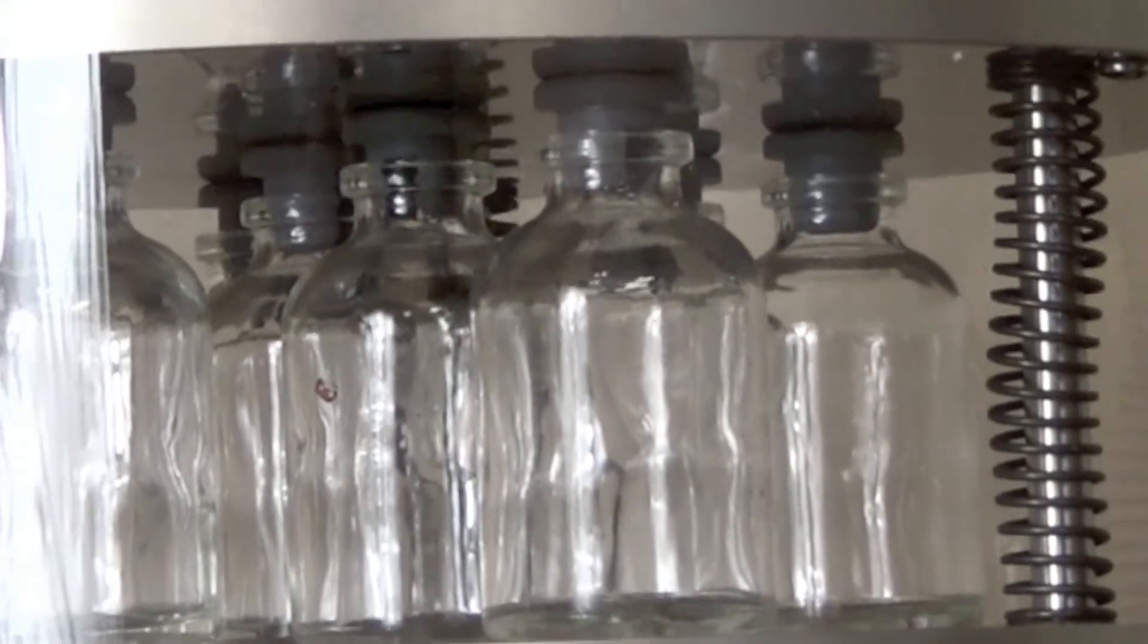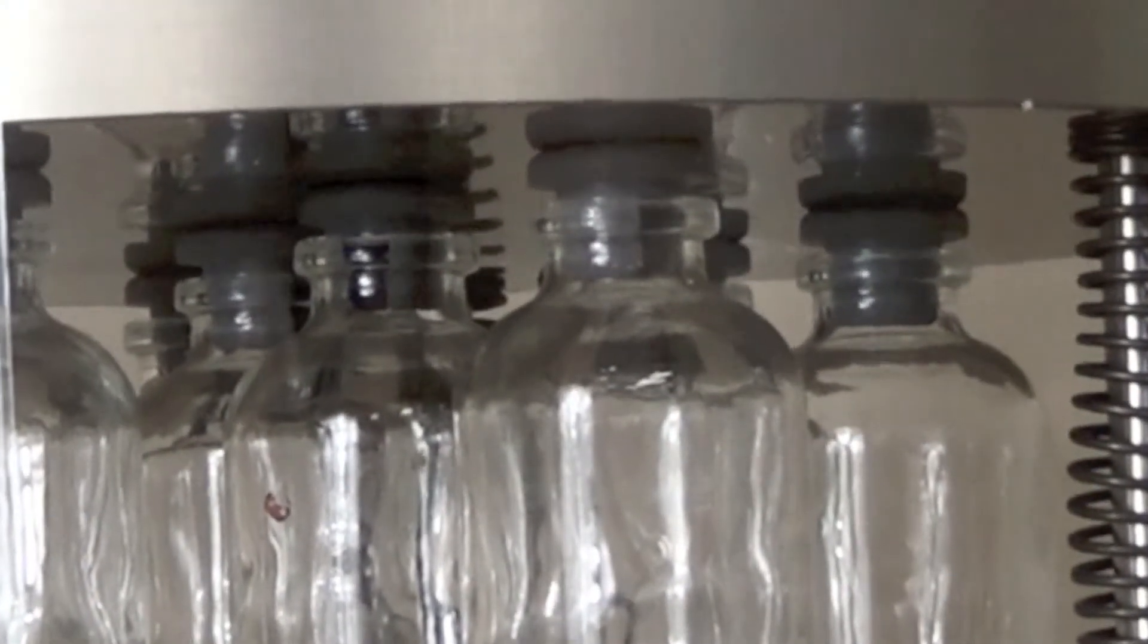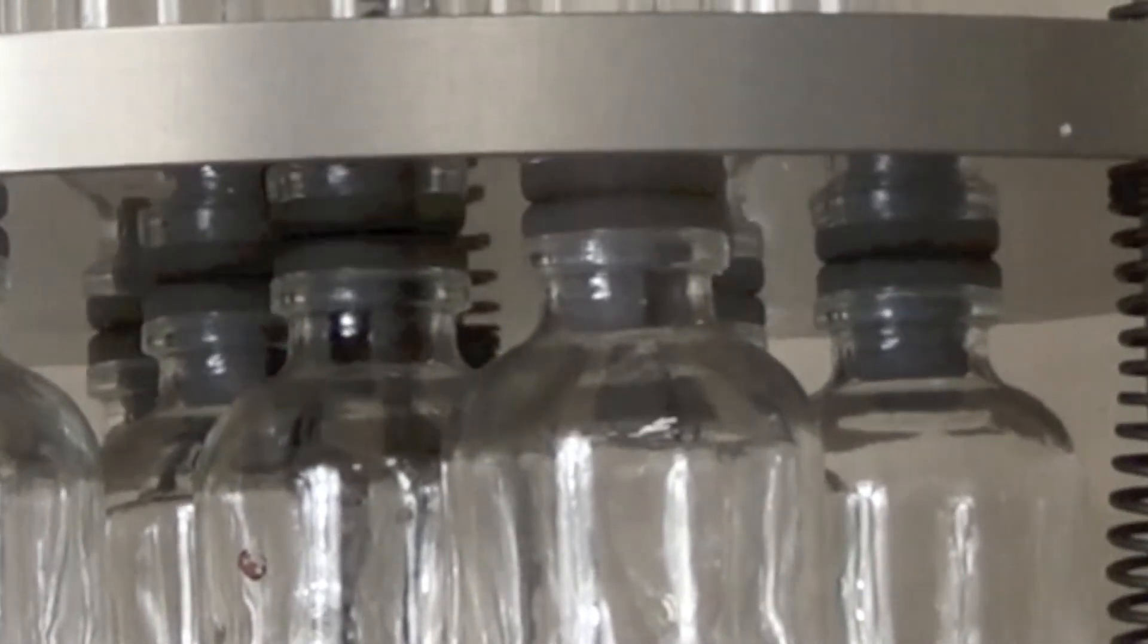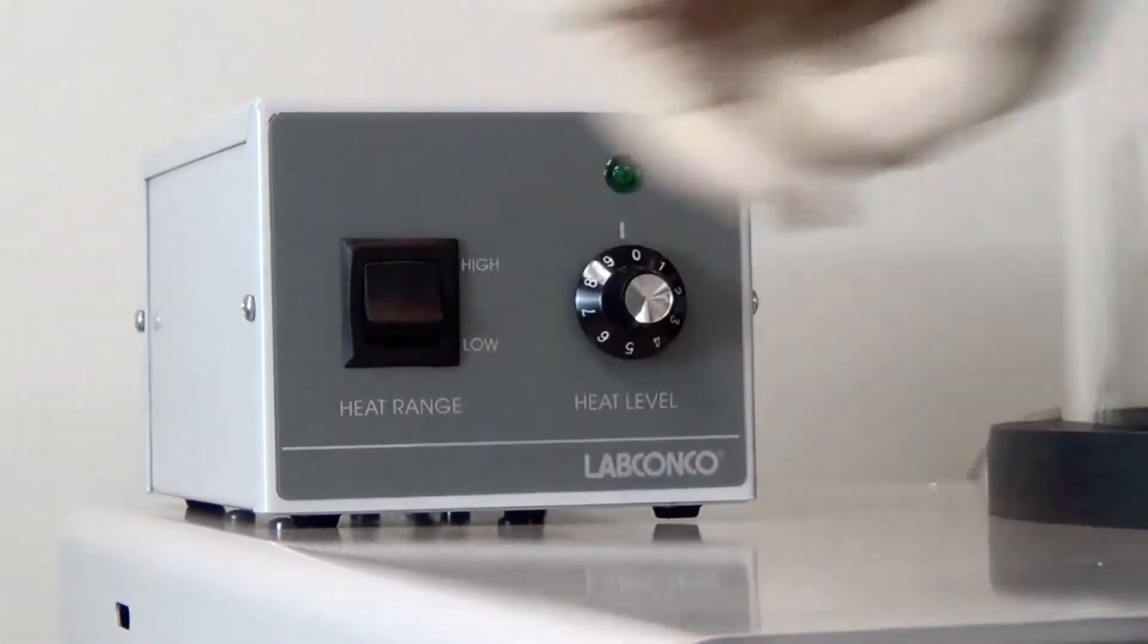When the freeze-dry process is complete, the clear stoppering chamber allows you to stopper the samples under vacuum for long-term storage. Before stoppering, turn off the shelf heater if one was used.